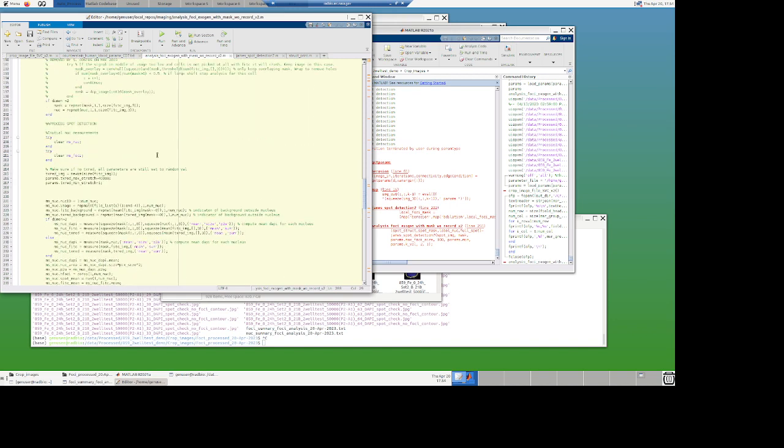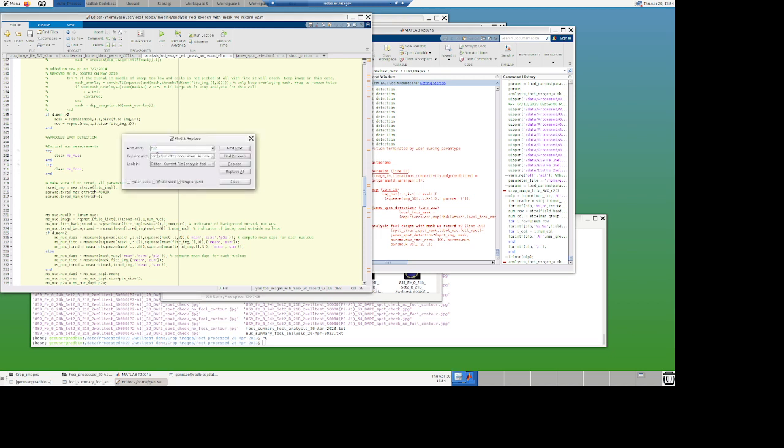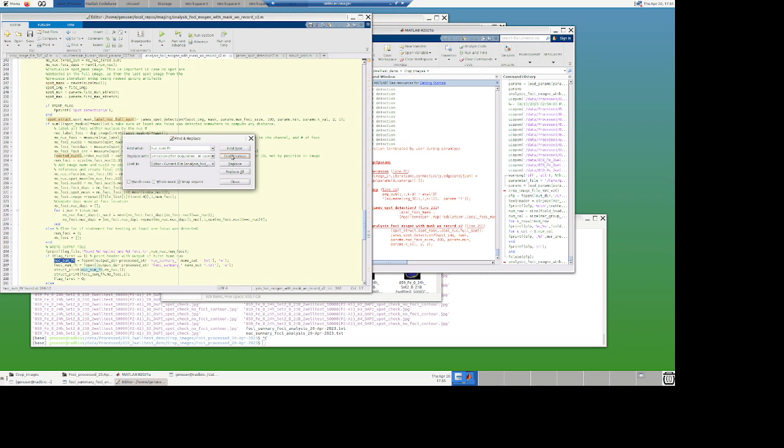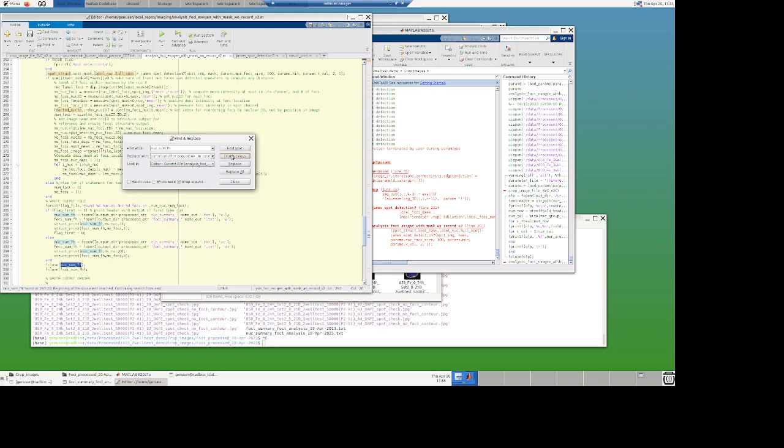It's been a long time since I've looked at this, so apologies. Control F, nuke. File header. Let's see. Previous. I forgot. It's just opening. It's just the output file. Yeah, it's just the ID. I'm wrong.